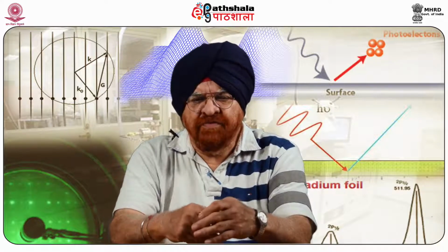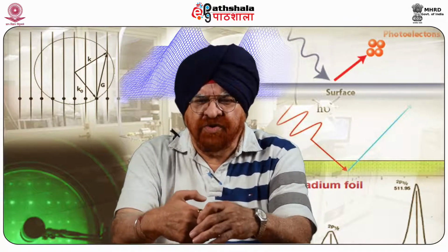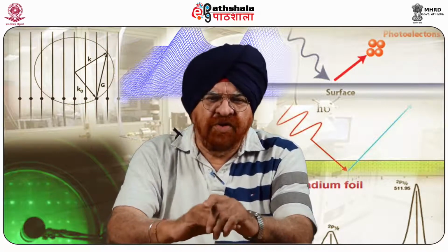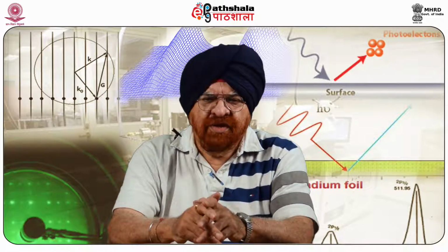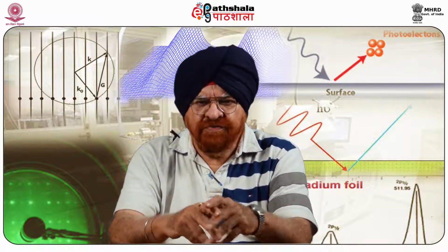In this module, we will be talking about the introduction of this spectroscopy. This obviously comes under the paper Surface Analytical Technique Part 1.